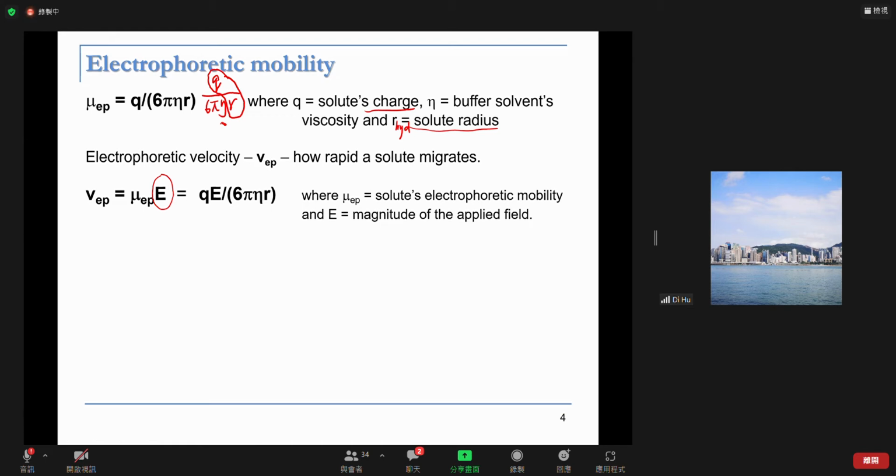We're still thinking about a group of ions, because this is a little bit different from IC. In IC, if we're talking about affinity to the column, the double charge is definitely much stronger than the single charge, the monocharge one, but that's not really the case in capillary electrophoresis.